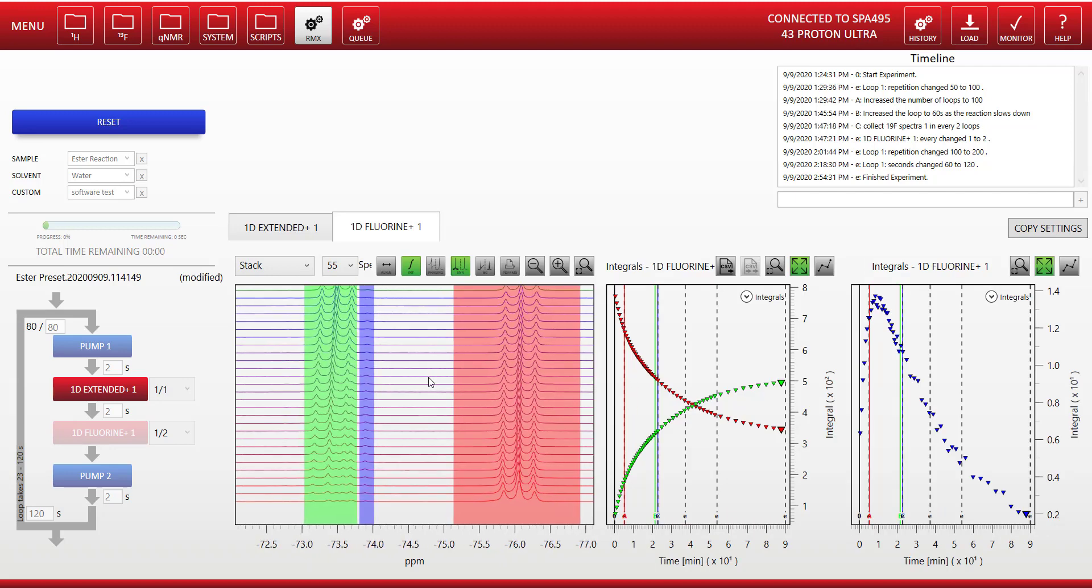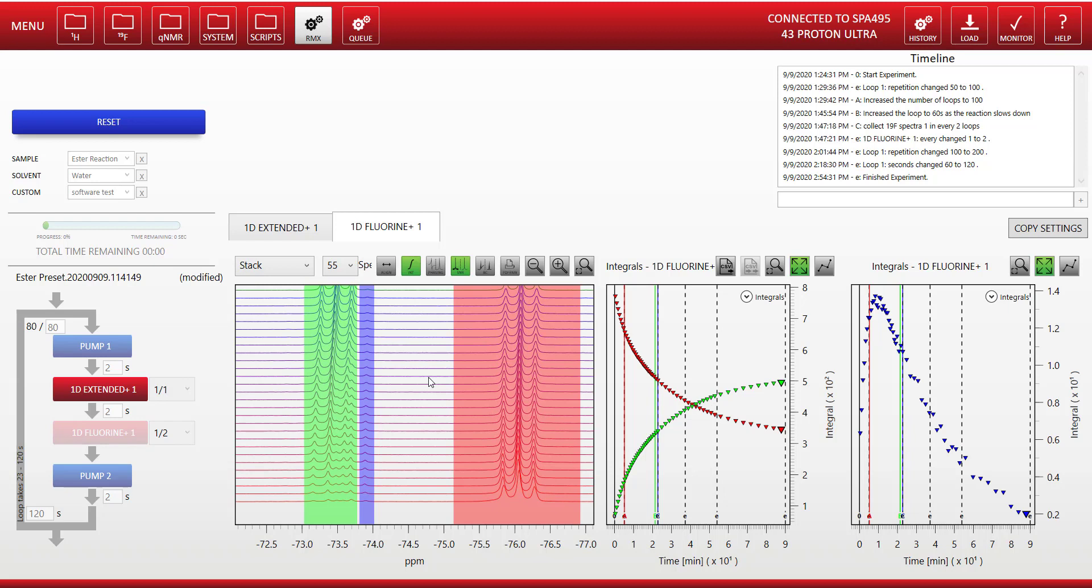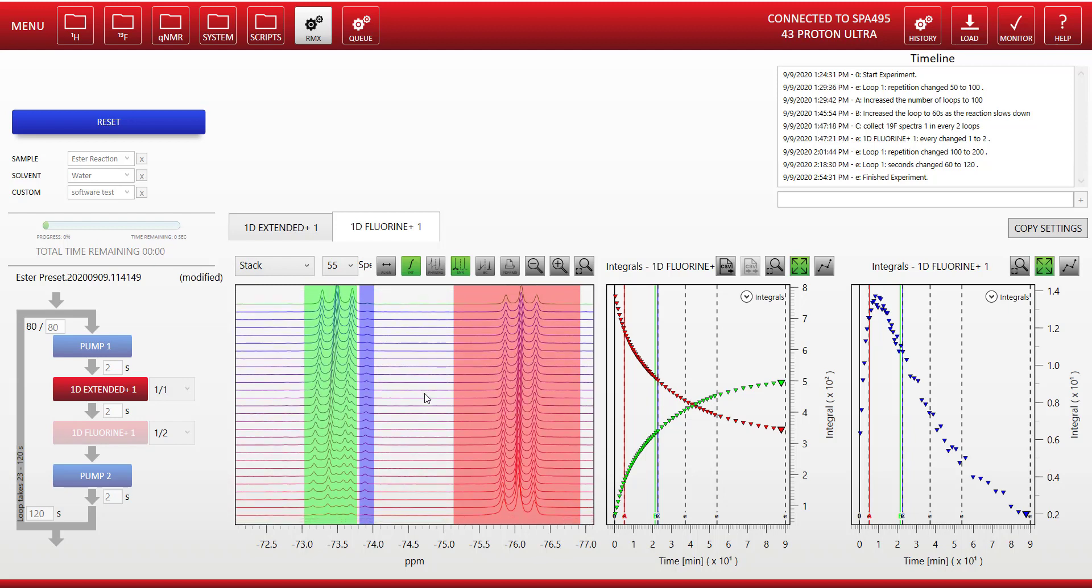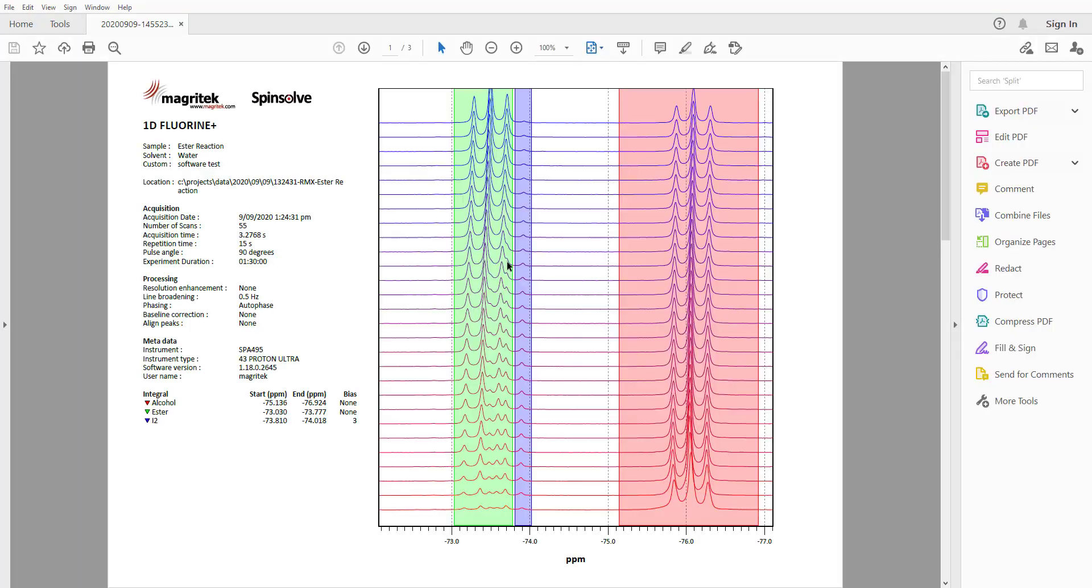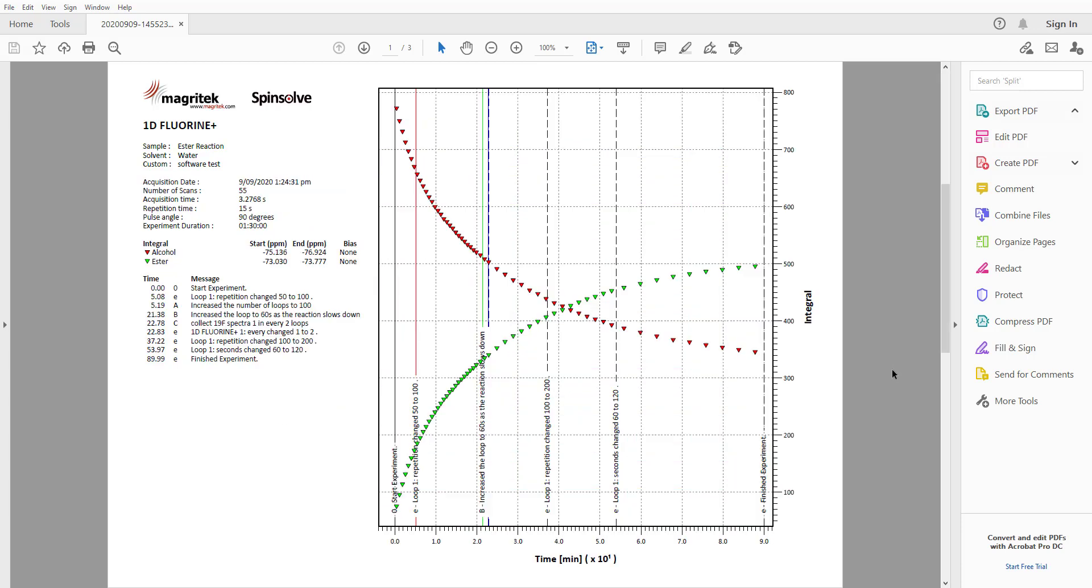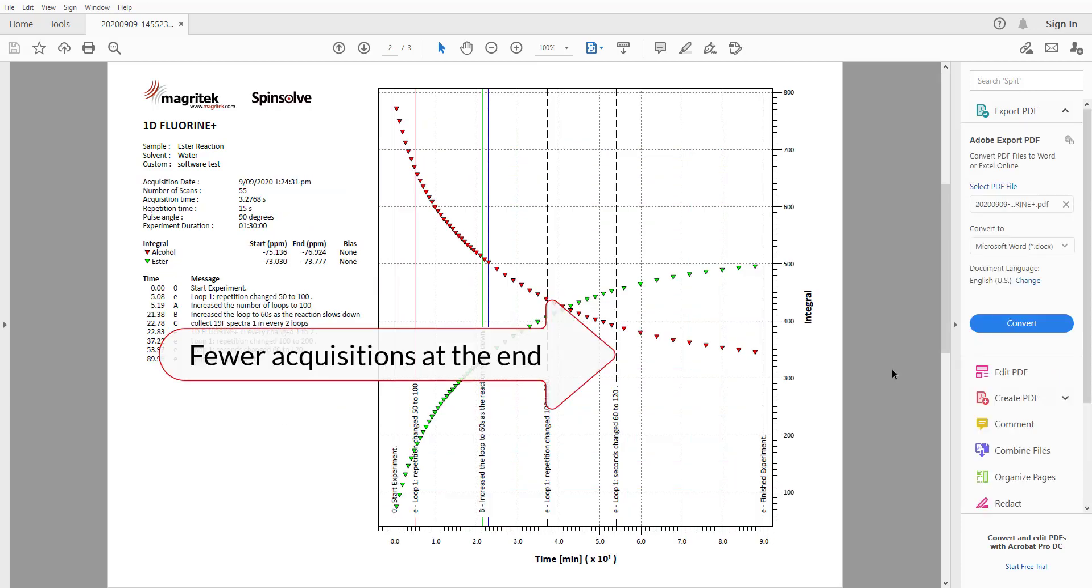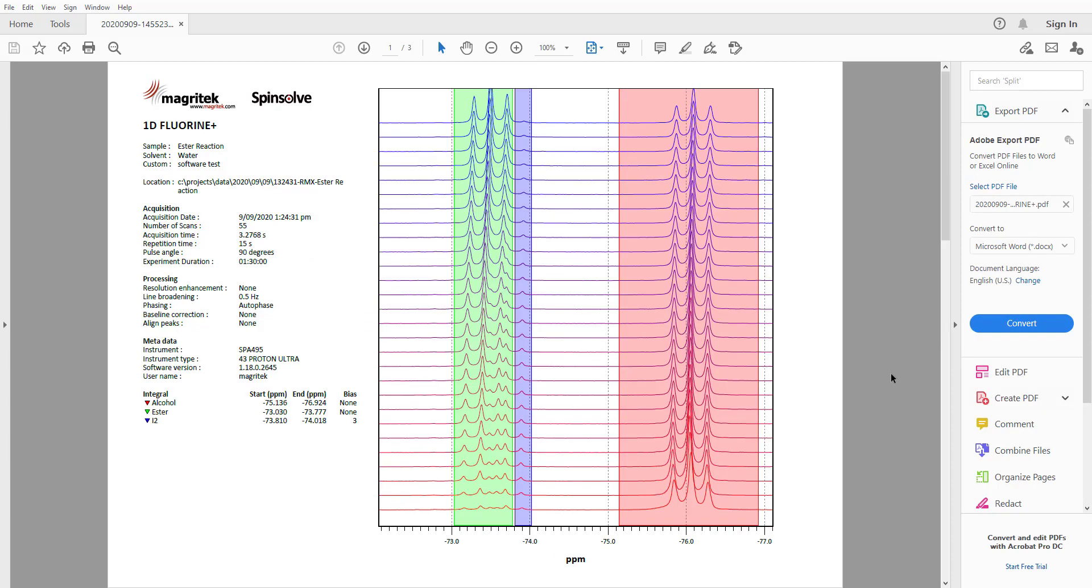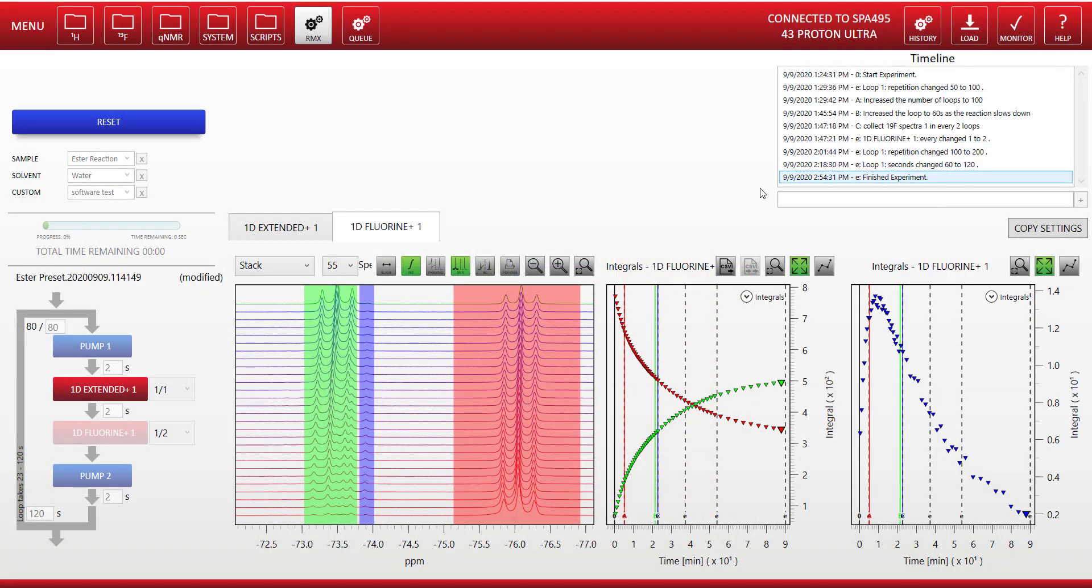Remember, we didn't have quite as many scans of fluorine because we changed how often we wanted to acquire at the end there. And you can see the data at the end on the integral plot is getting more spaced out because we changed how often we're acquiring data.